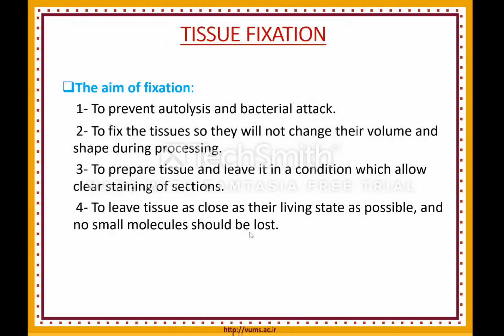For fixation, we use some chemical materials such as formalin, glutaraldehyde, all different aldehydes that are generally used in the pathology and histology laboratory.